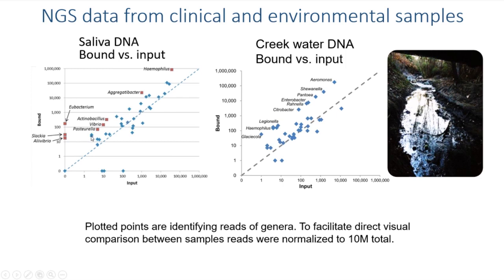There's a number of genomes that are dramatically enriched. We've highlighted a few that are known DAM organisms, that is, that they have GATC methylation. There are several organisms that were not even detectable in the input that suddenly become highly enriched. And there are a few that are somewhat depleted.